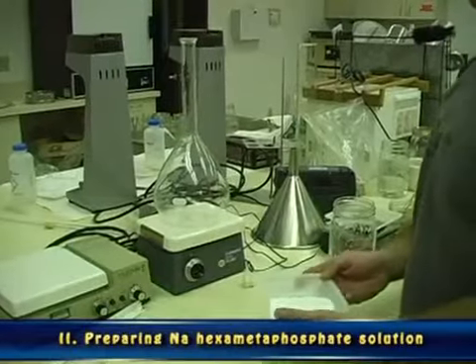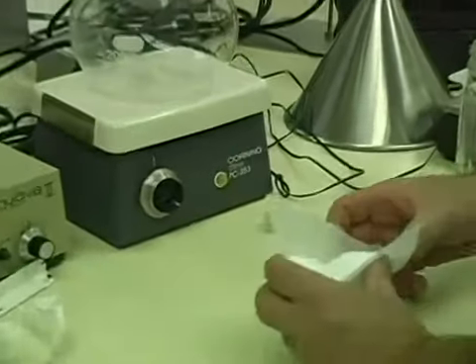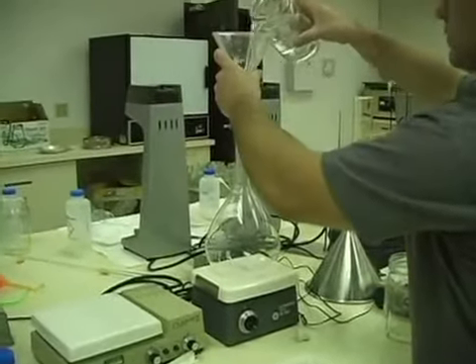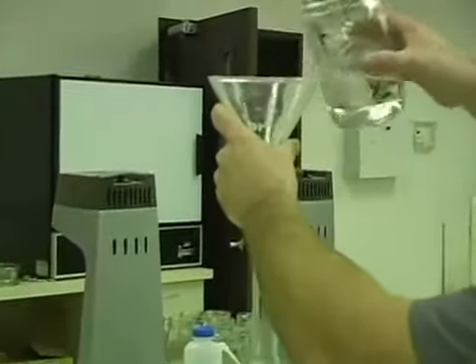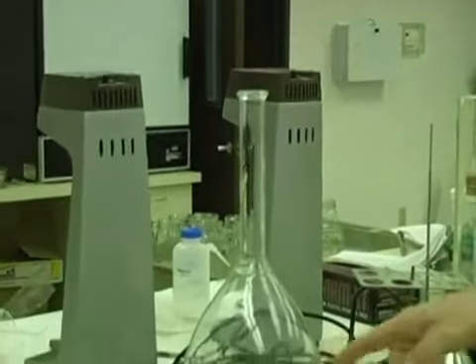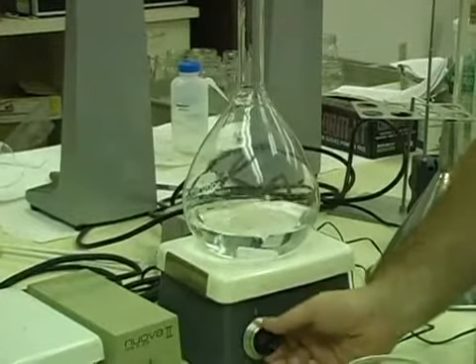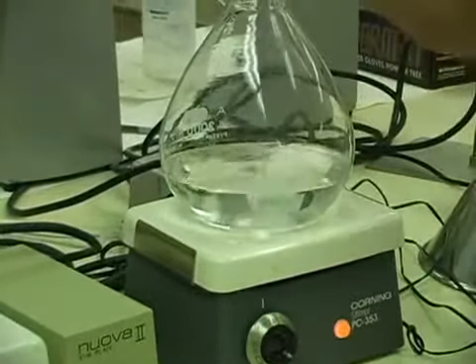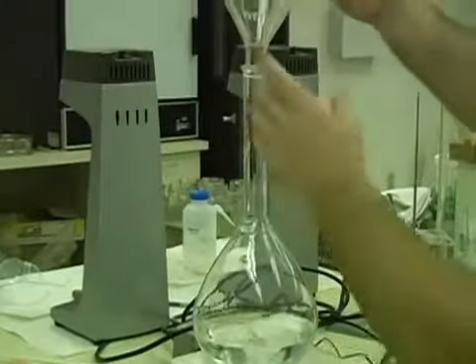Now we have to prepare a sodium hexametaphosphate solution, which is a soap solution that helps suspend the soil particles. We've got to add some distilled water. We've got this container on top of a stir plate with a magnetic stir stick in it, and first we're going to turn that on to get it moving. And then we're going to begin to add the sodium hexametaphosphate powder.